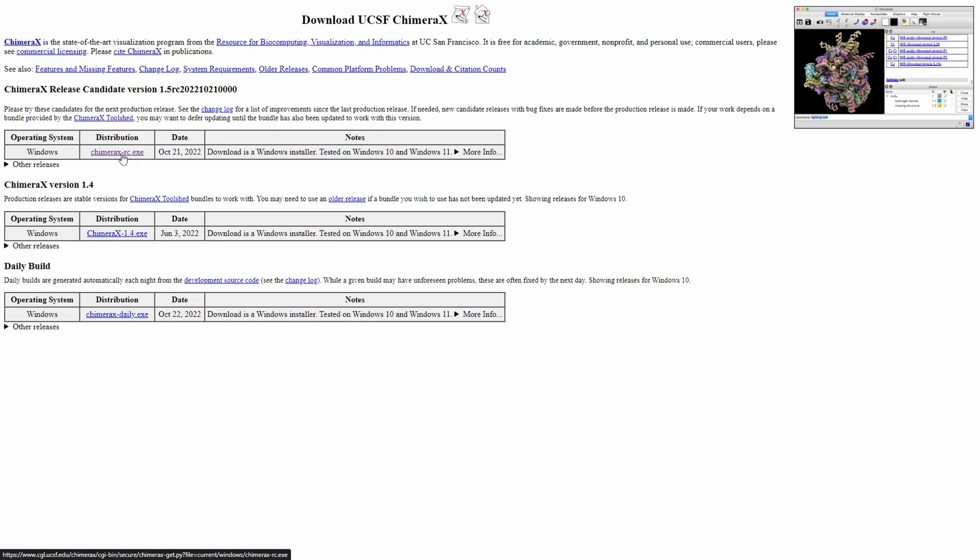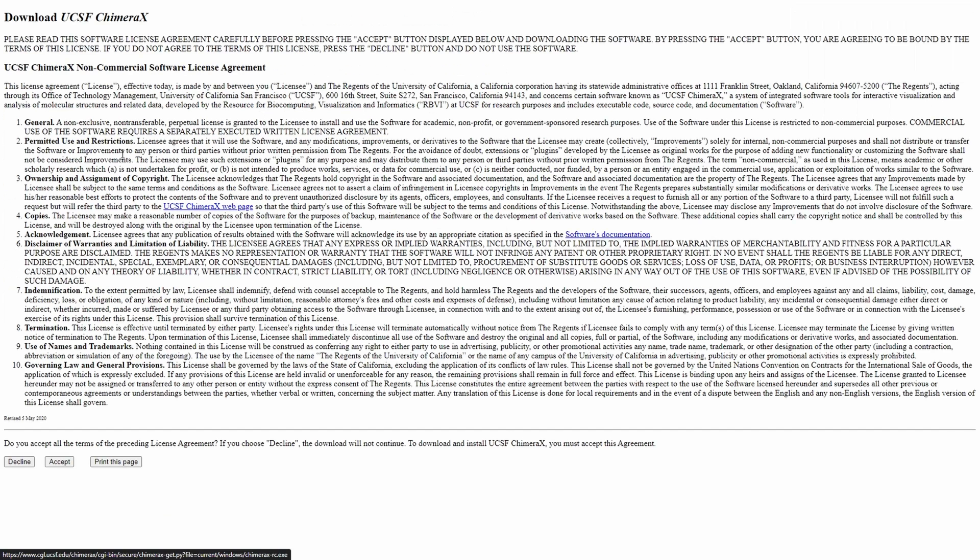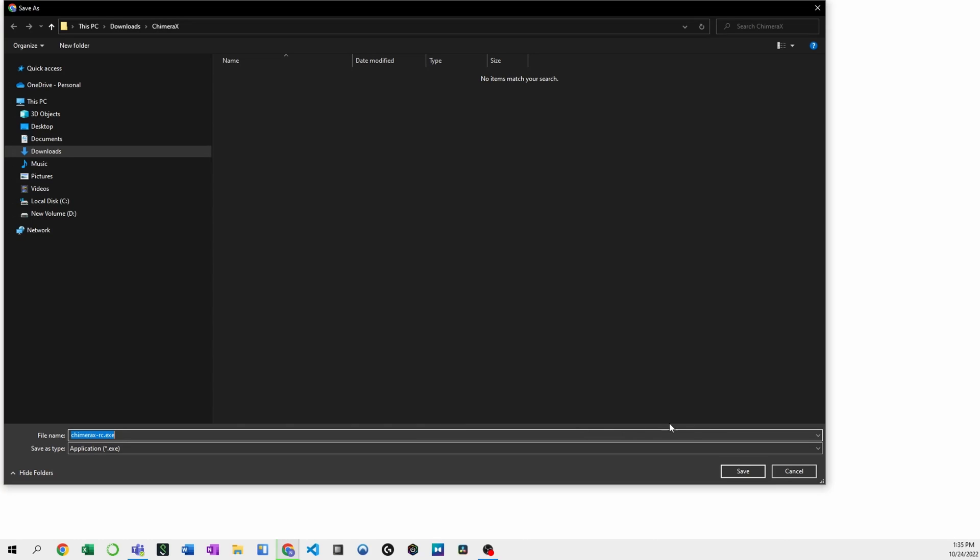I'm going to select the Windows version, and we're going to go ahead and accept the License Agreement. The download should start automatically, if not, go ahead and click that link, and we'll skip ahead to when it's downloaded.